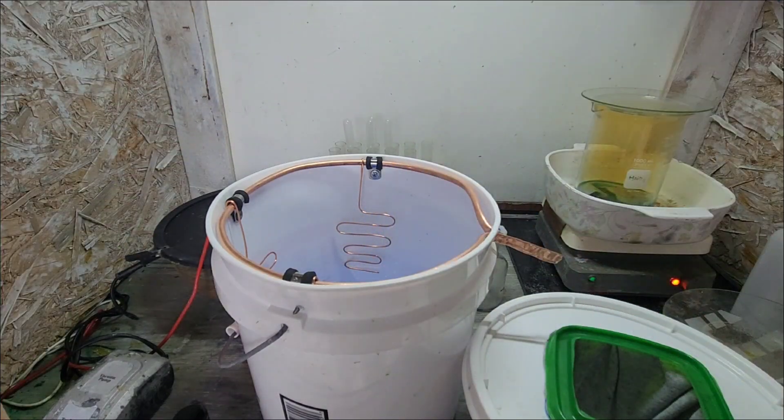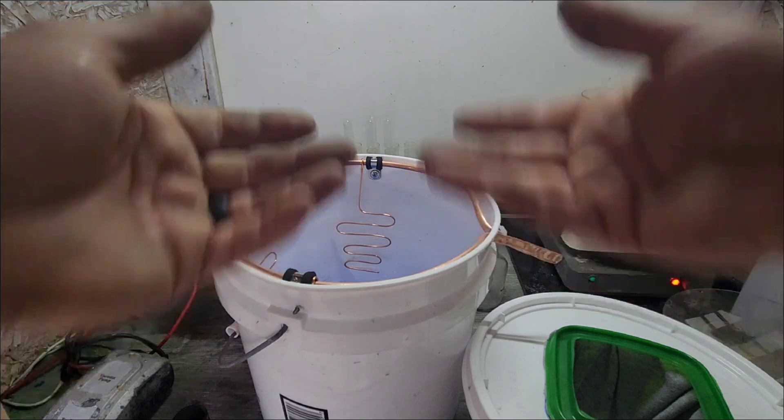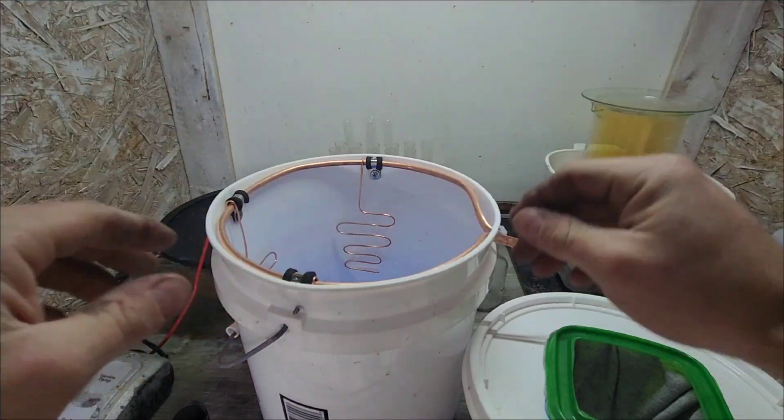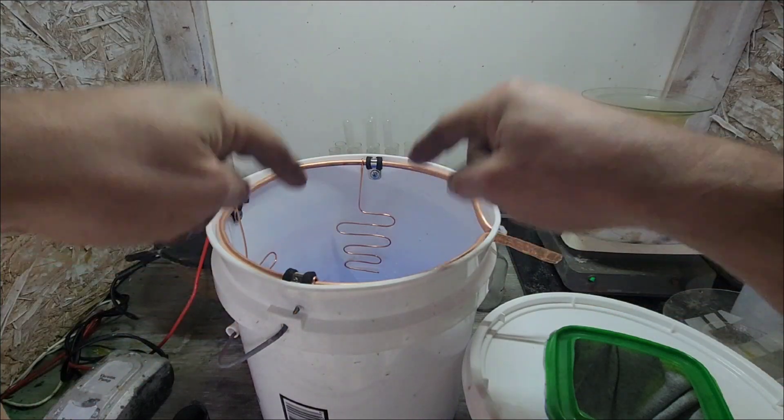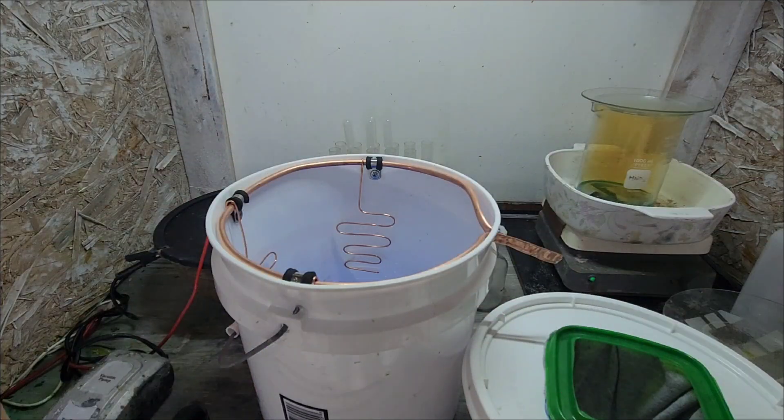It's only going to be small amounts at a time, so I'll see what the distilled water can absorb. If it absorbs at all, I'll add some more, and if I have a little bit of crystal on the bottom after everything is done and over with, I'm not too worried about it.